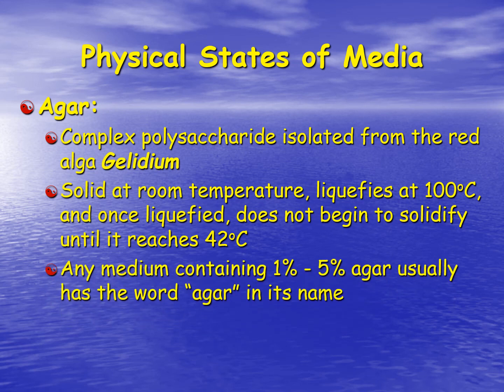Any media that contains anywhere from 1 to 5% of this agar usually has the word agar in its name. So we can have brain heart infusion broth, which would be the liquid form, same ingredients except it simply doesn't have agar in it, or we can have brain heart infusion agar, where we've added the agar so it will solidify at room temperature.